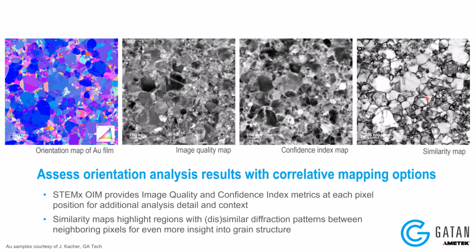So by understanding, for example, what the image quality metrics are, what the confidence index metrics are at each pixel position, and then looking at what the orientation result is, we can assess how good of a fit there was of the STEMx OIM results directly within DigitalMicrograph.